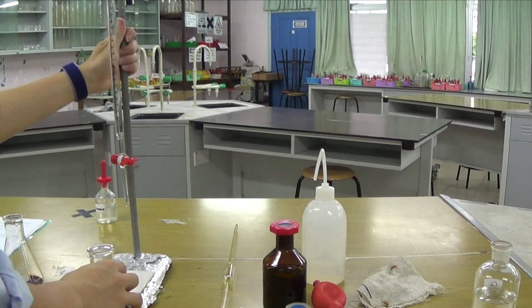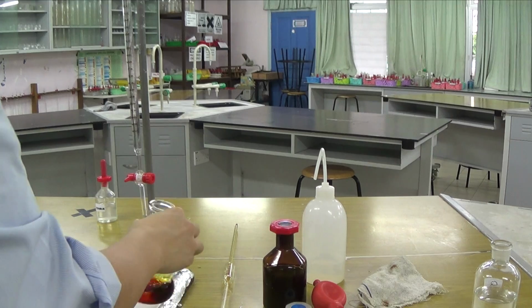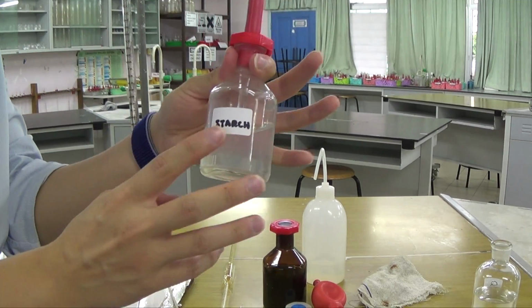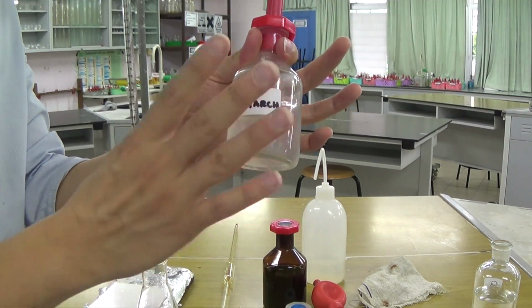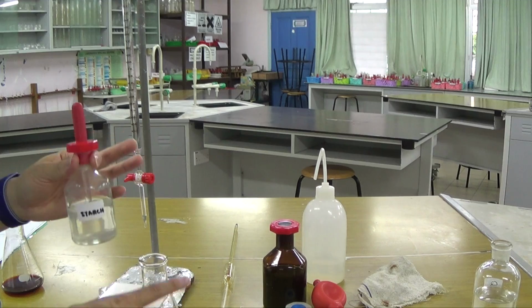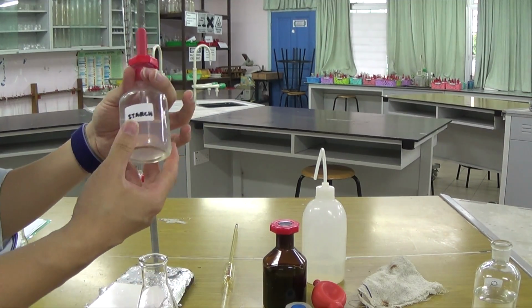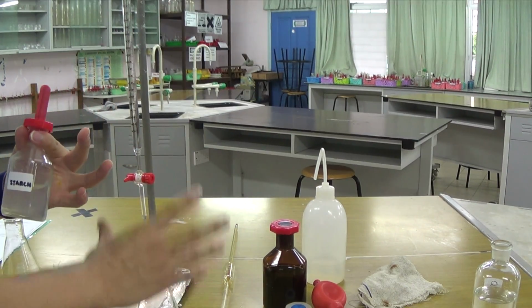So I've got a white tile at the bottom here. Let me just move my camera around. Okay, I've got a white tile here so that I could see my color change better. I'm doing a rough titration, and they did say that we want to add a starch indicator. So starch is this kind of cloudy, colorless solution. In the presence of iodine, it will turn the solution blue-black. That's the test for starch in food, in biology. But what we're going to do is add starch to this substance and it turns blue-black because this substance contains iodine.